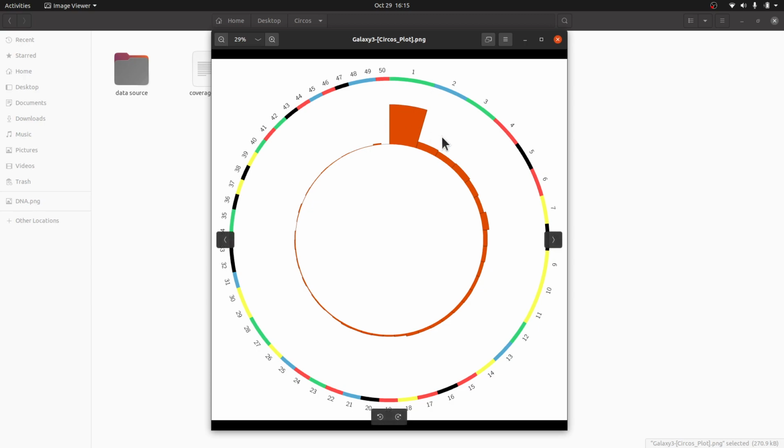And also with the histogram, this strategy can also be used, for example, in gene expression analysis. For example, you have done a gene expression analysis, you want to visualize the counts, or let me just put it this way, the number of differentially expressed genes across the chromosomes. You want to count them. You can use a similar approach to visualize, and that will also give you a good plot for you to start with.